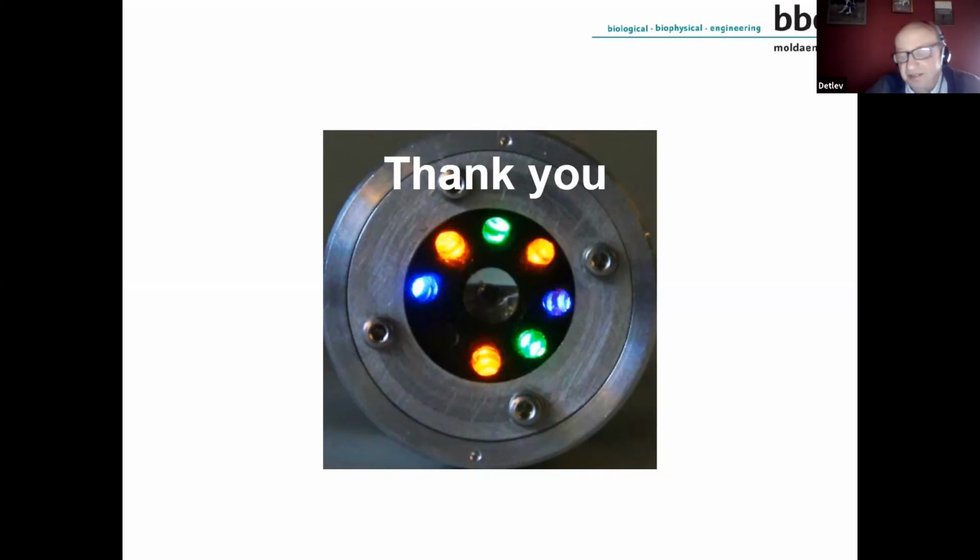Usually it's not necessary for the AlgaeTorch, because we only measure total chlorophyll and cyanobacteria. For the cyanobacteria, it fits quite well, but sometimes we had outliers, and in other instruments that we offer, we could also introduce a special algae class different from what we have here. So in general, we can say this fit is rather good, but we had some exceptions where we have to adapt it.